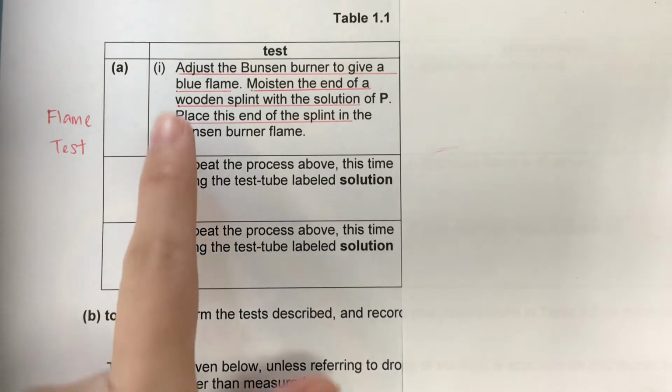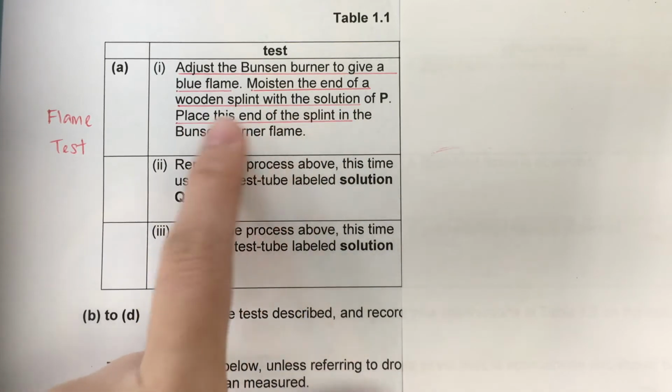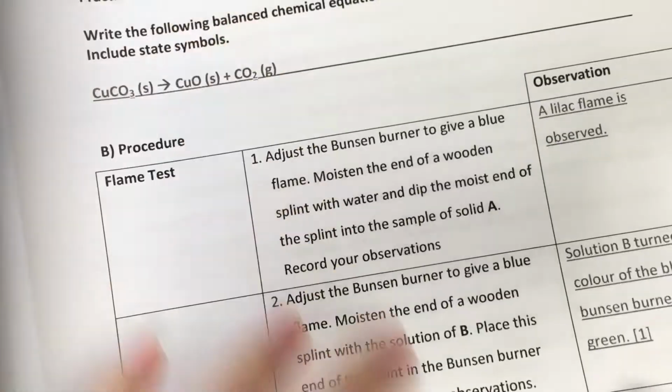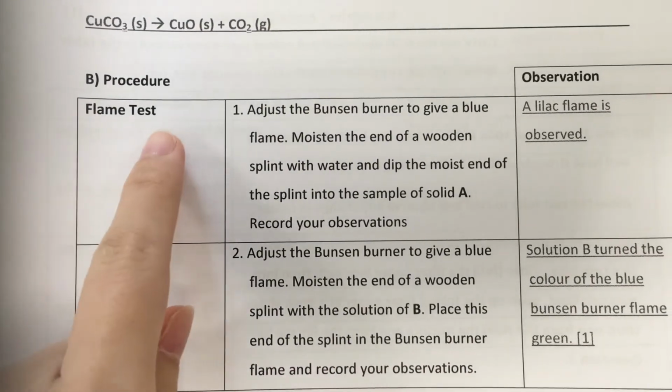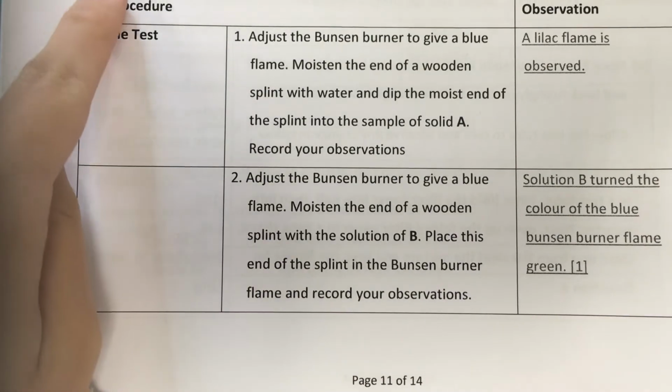Okay, for this practical, if you read the description, this would match the description for flame test. And how do you know? If you refer to your notes, flame test, you read the description exactly the same. It's on page 11.